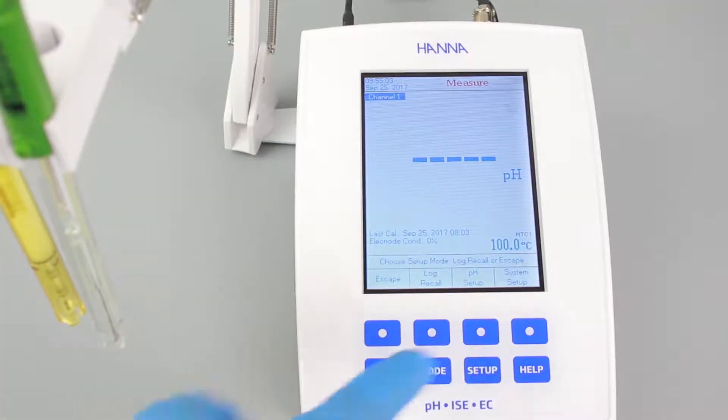Once the meter is on, you'll find that there are many different options to choose from. We recommend starting with the system setup. Press the setup button and then system setup.